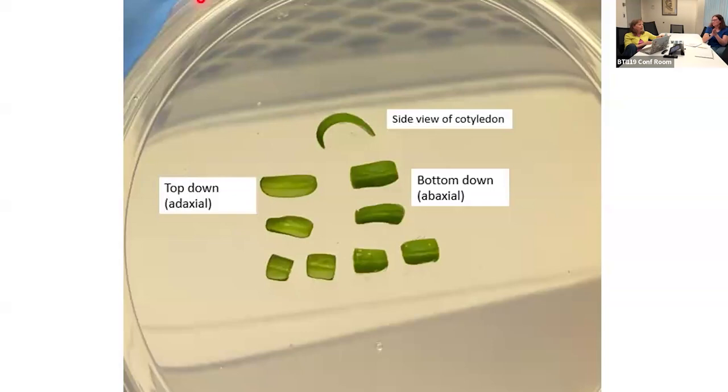Yeah, because Carrie can explain, it's not really blotting, it's more draining. But one time we had somebody in the group and we showed them how to do the transformations, but then people go off and don't remember. We were wondering why she was getting such a low transformation efficiency compared to others in the group.